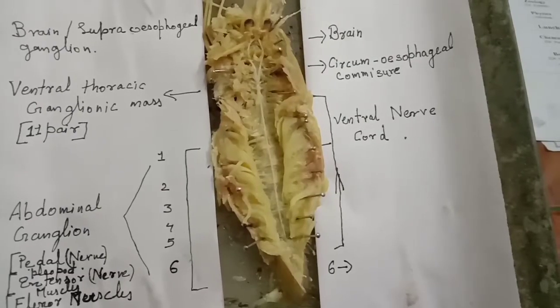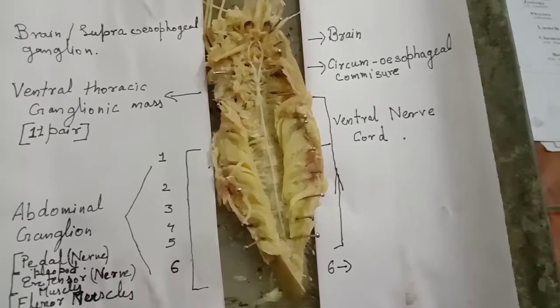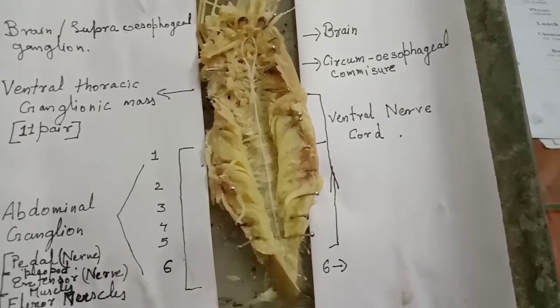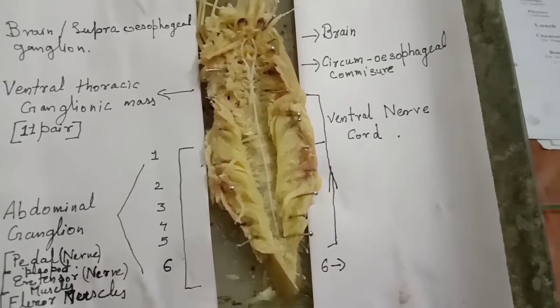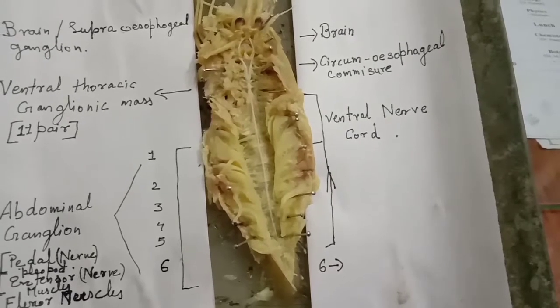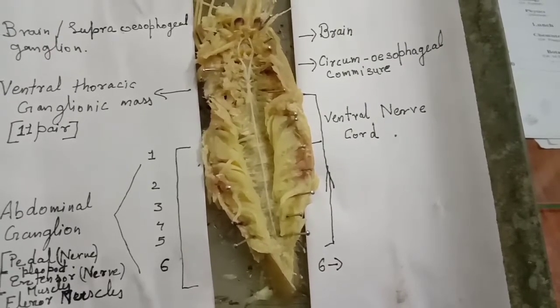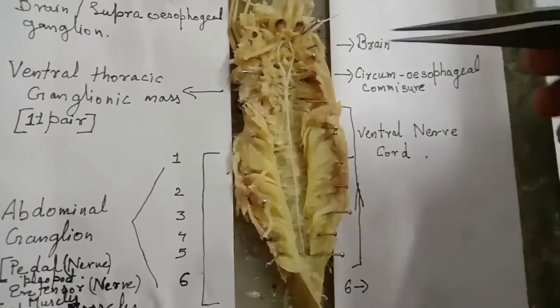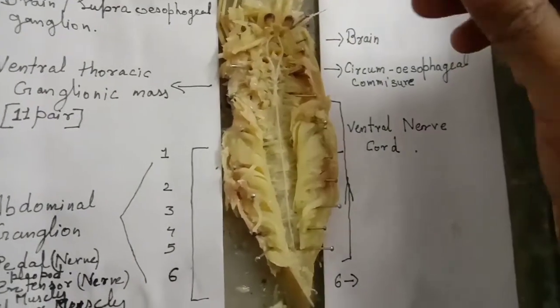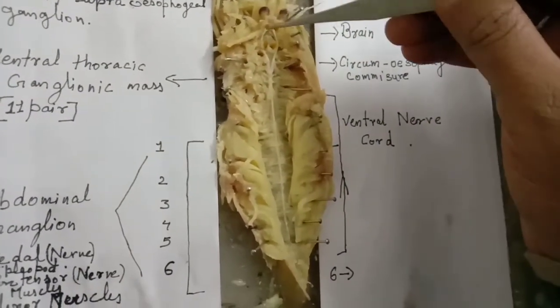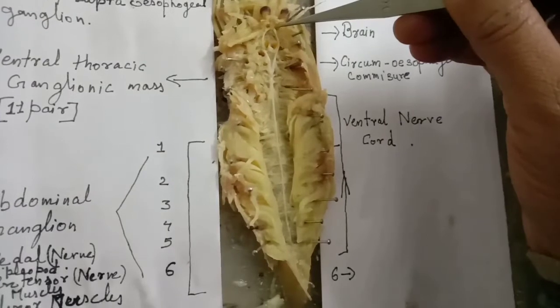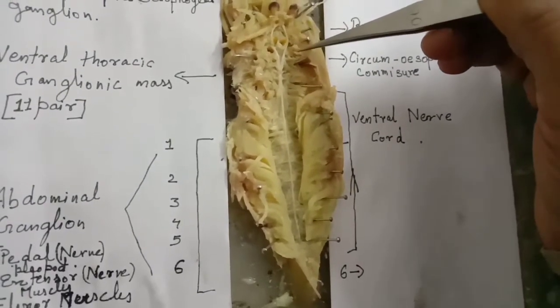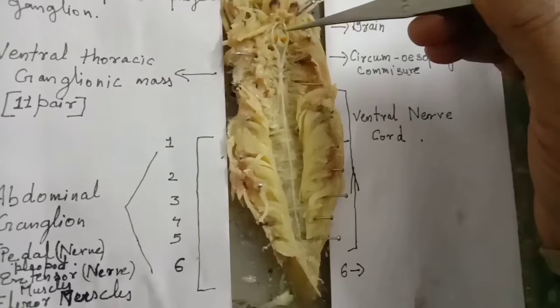The rostrum should be cut away and the cuticle plates overlaying the brain should be removed. Carefully, with a needle, study the various parts of the nervous system of Palaemon. The brain, or supraesophageal ganglion, is a bilobed ganglion situated at the base of the rostrum.